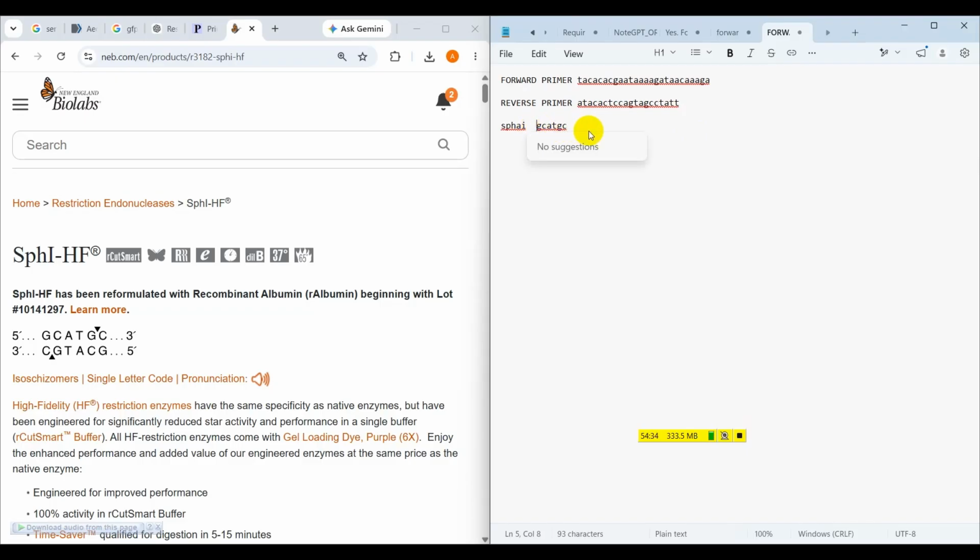And here the main thing comes. For maintaining the integrity of our desired gene, I mean the GFP, we need to give here extra 3 G, because this is the mechanism of how restriction enzyme works. I mean, it recognizes one sequence, then cuts some sequence later or before. So that's why you need to add some extra nucleotide sequences like triple G, because GC has three hydrogen bonds, and it's a powerful bond.